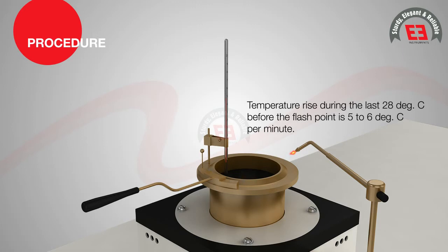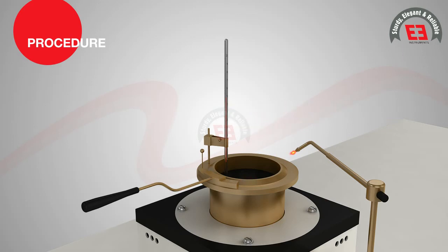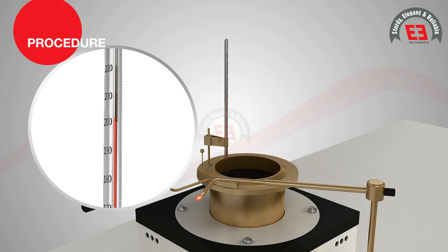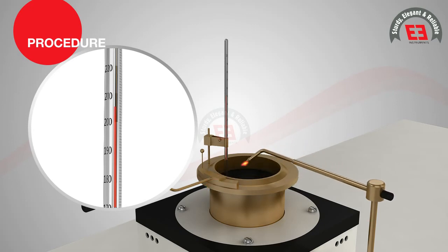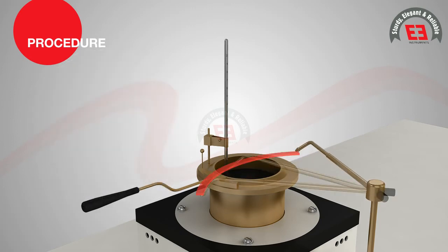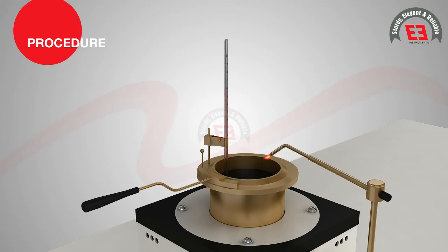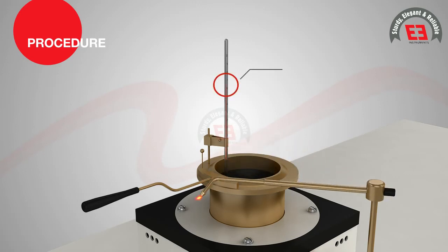Apply the test flame when the temperature of the test specimen is approximately 28 degrees Celsius below the expected flash point. Thereafter, at every rise of 2 degrees Celsius, pass the test flame across the center of the test cup at right angle to the diameter which passes through the thermometer. The test flame is moved in a horizontal plane having an arc of at least 150 mm and not more than 2 mm above the upper edge. The flash point is taken as the temperature read on the thermometer when a flash first appears at any point on the surface of the sample.